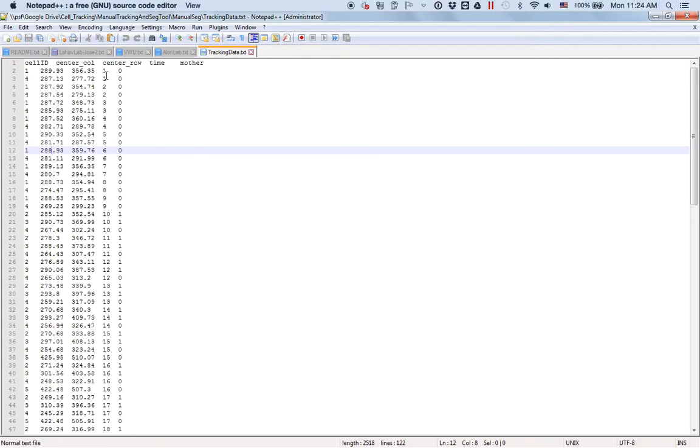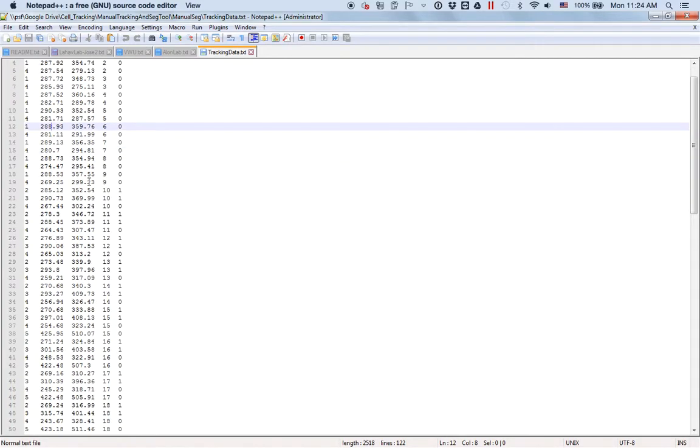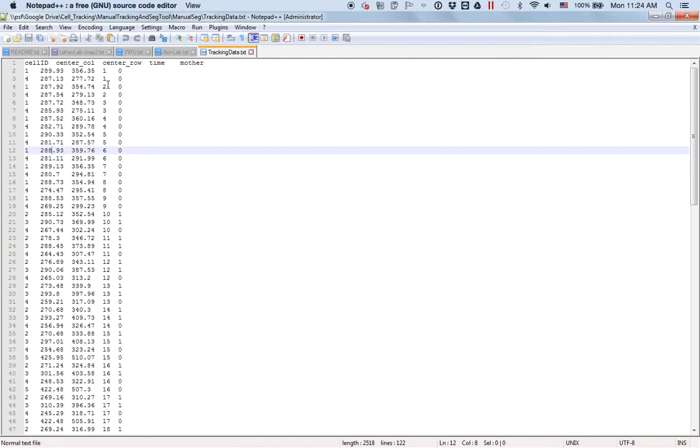So cell number 1, we have it in time frame 1, and it's now number 4, but it actually is the 4th cell that we tracked, which was after 1.a1 and 1.a2.